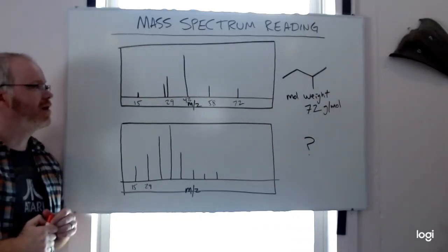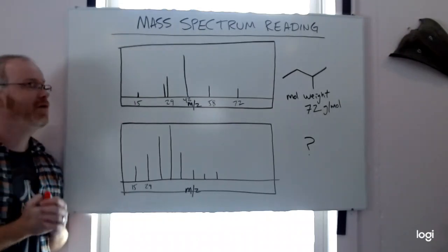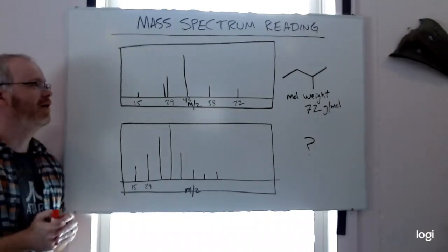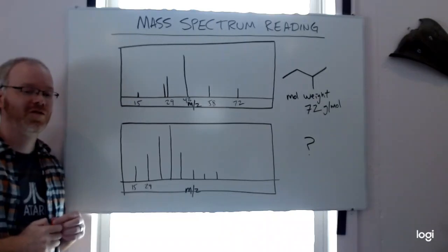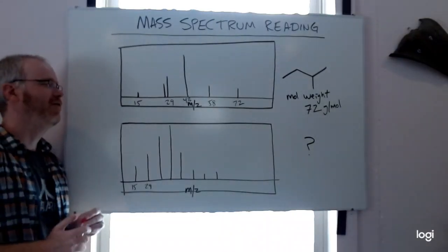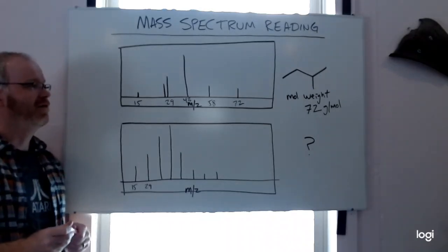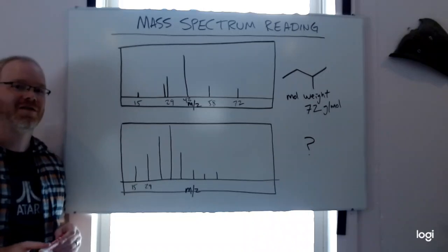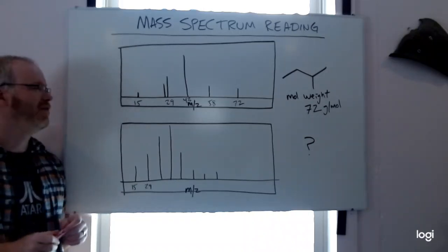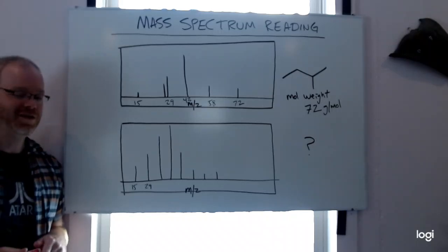How we read a mass spectrum. They are at the same time pretty simple and pretty complicated. And my cartoonish versions of a mass spectrum aren't going to look quite like a real one. Definitely do yourself a favor and look up a mass spectrum for a simple hydrocarbon or look at examples in the book. It'll give you a little more of a detailed picture. We'll talk about some of those details and some basics in reading these spectra.